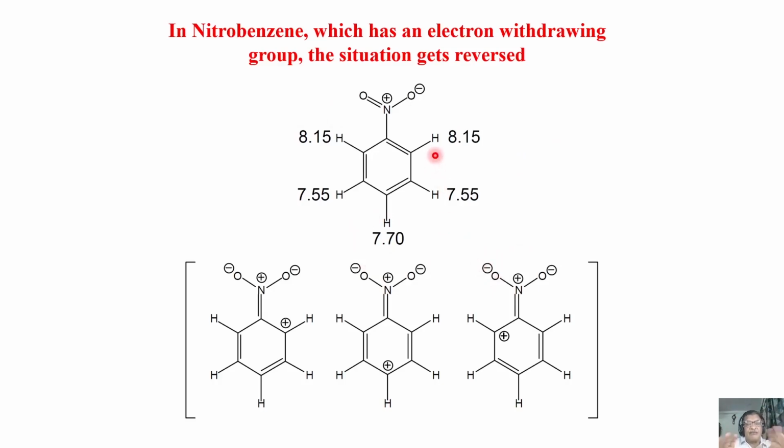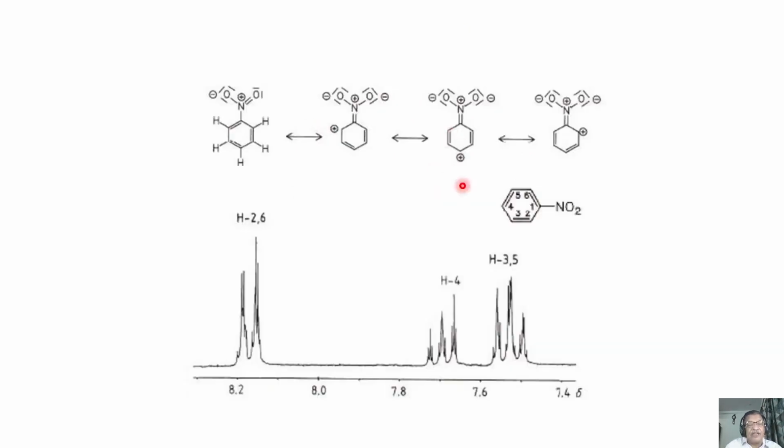Okay, same. The phenomenon as far as where the electron charges are residing in this molecule is opposite to aniline. So the peak pattern will be different here. Okay, look at this one. This is... meta comes here, ortho and para come here, unlike in the other case.